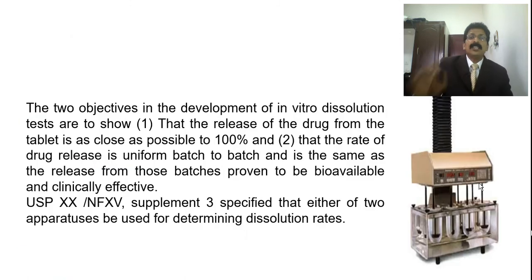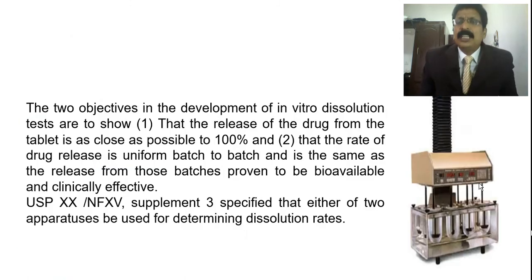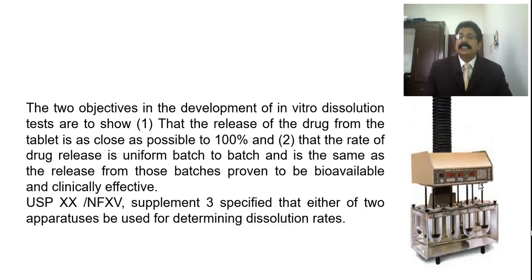So the dissolution test, we can see that it is a big long process, but still we are making it into different types which are available. The two objectives in the development of the in vitro dissolution test are shown. One is that the release of the drug from the tablet is as close as possible to 100%. This is a very important point.